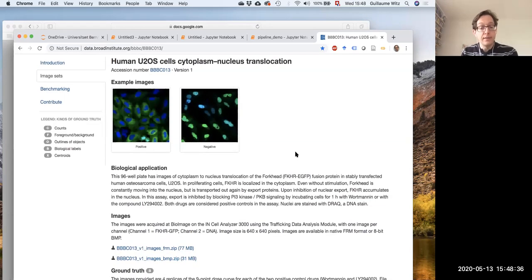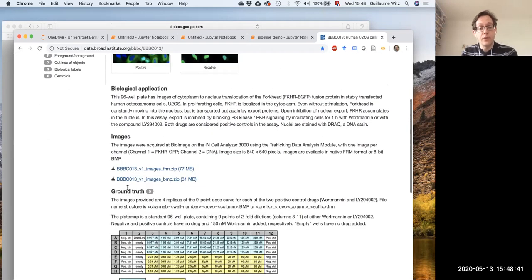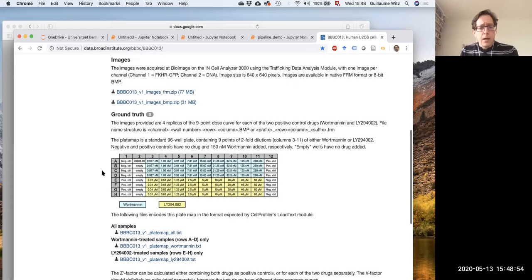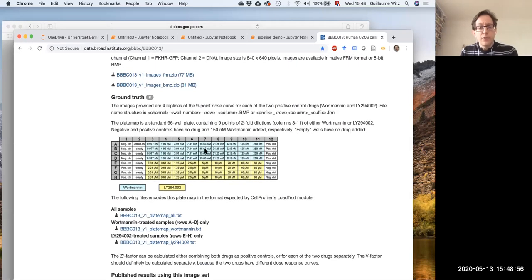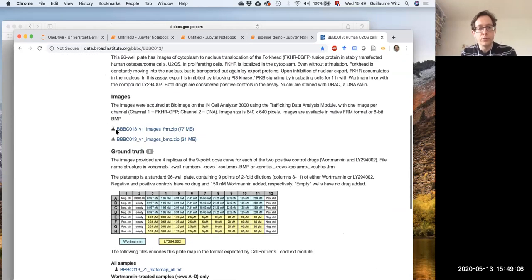So we are going to get a lot of data from a plate like this. So for now, we forget about the fact that we know what treatment was done. Of course, it's described here. We just know that we have for each line a given treatment, so you have in blue and in yellow different types of treatments, and you have replicas. Okay, so you can download this data if you want at a later point to try this. I will put some notebook also at a later time point in the same repository, but you can see how this is done.